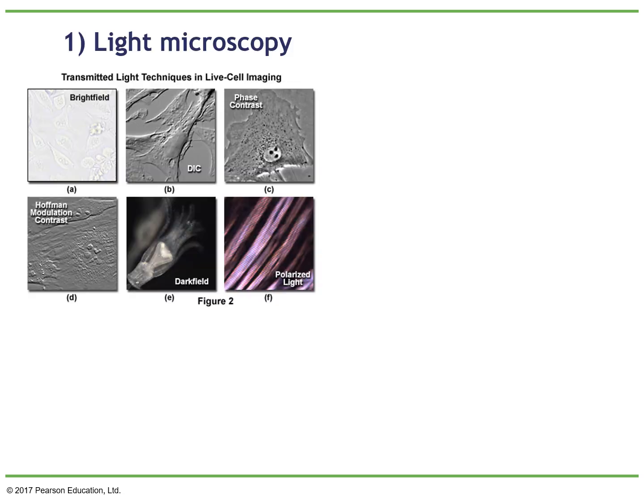We're going to talk about three different types of microscopy. One is the different variations of light microscopy, where we use light and different optical tools to see the different samples. Then we will talk about other tools, like staining and the microtome.